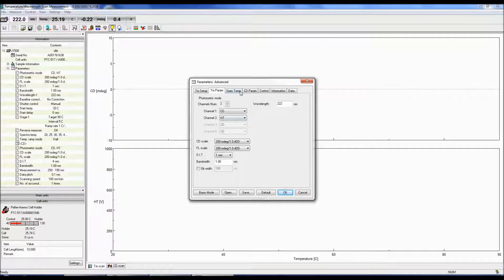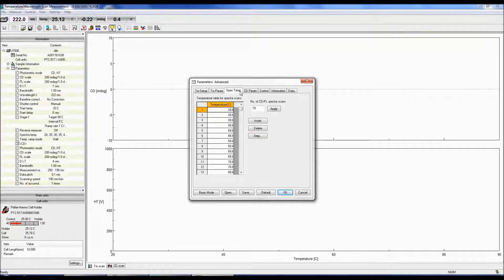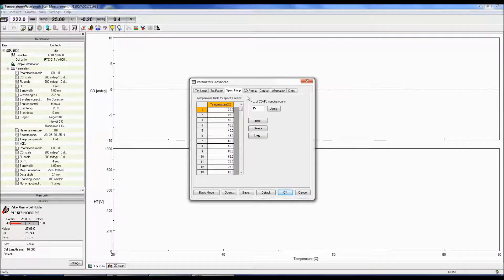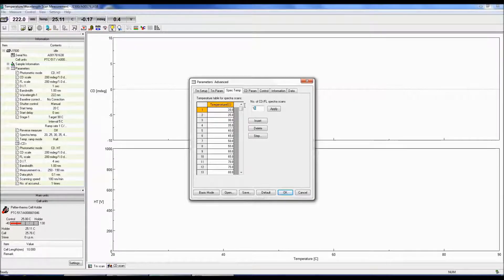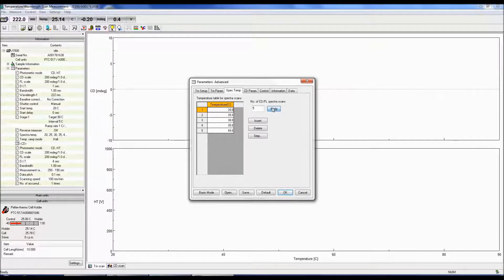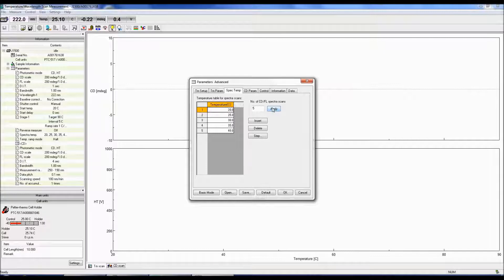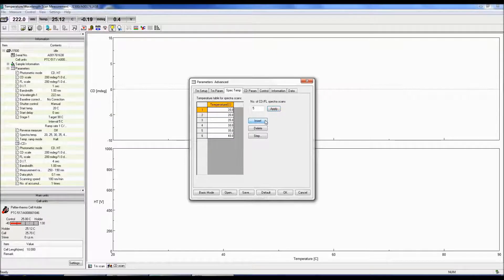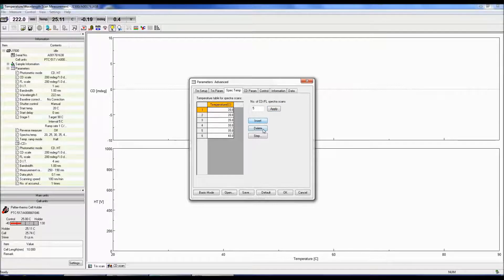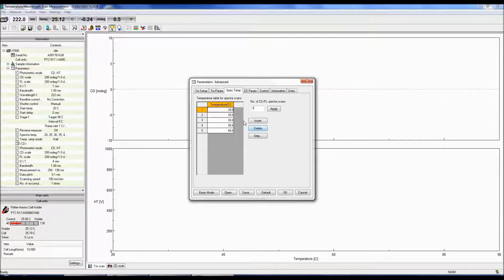Now we can specify how many spectral scans to measure and their corresponding temperatures. In the Spec Temp tab, enter the desired number of spectral scans in the Number of CD Spectra Scans text box. The table to the left will now populate with the corresponding number of scans. Clicking the Insert button adds an additional scan, while the Delete button removes a scan. Double-click on the text boxes in the sheet to manually enter the temperatures you wish to acquire spectral scans at.